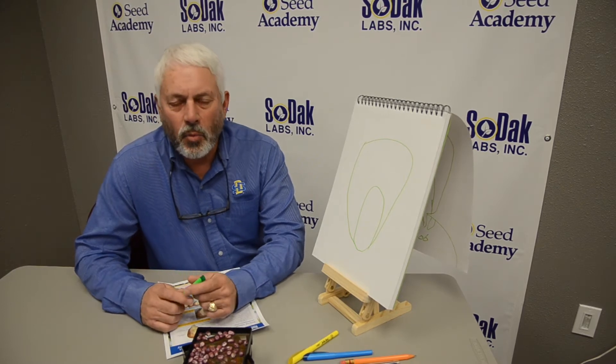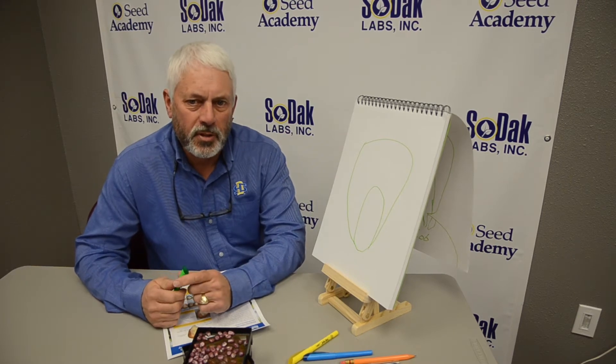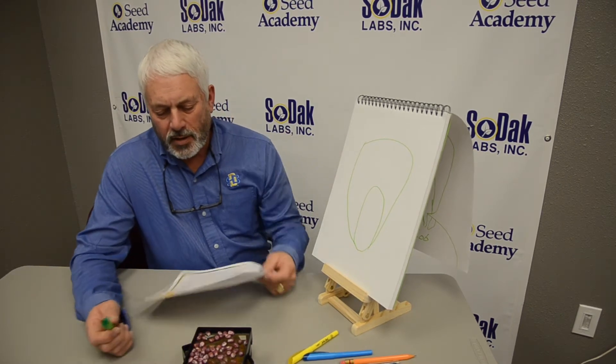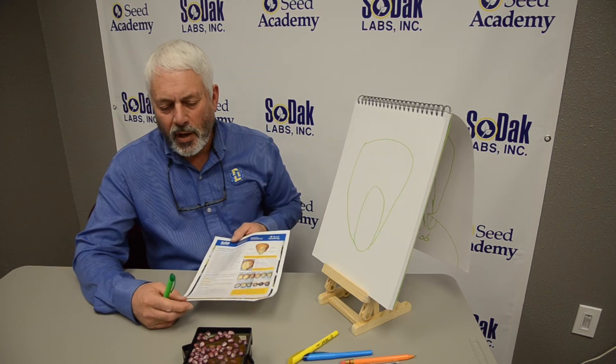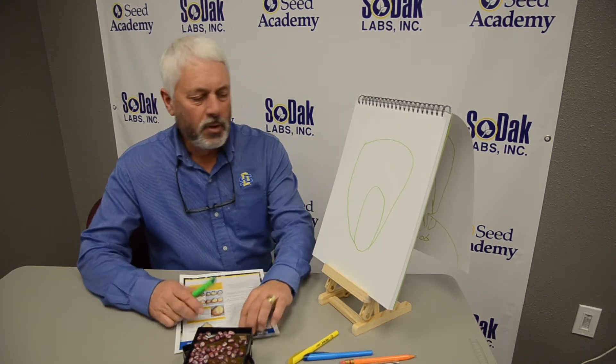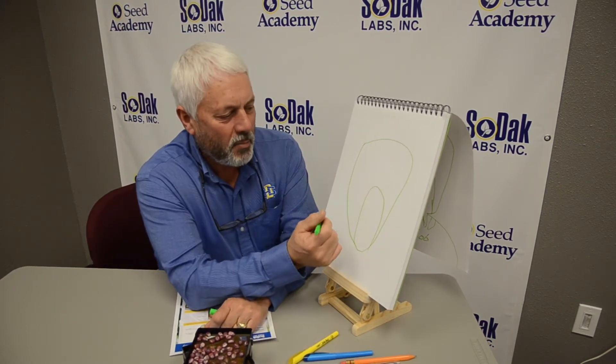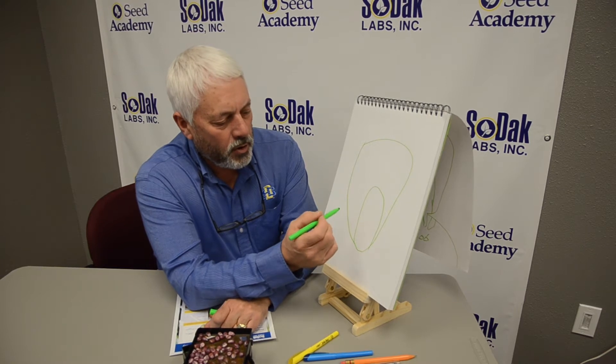This is a test that we're having more and more farmers ask us to perform on their seed corn. We're right in the process of putting out a flyer on it so people can understand it a little better, but I thought I'd start with just a rough diagram of a seed corn kernel.